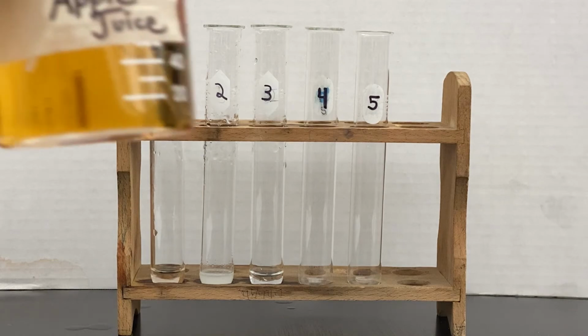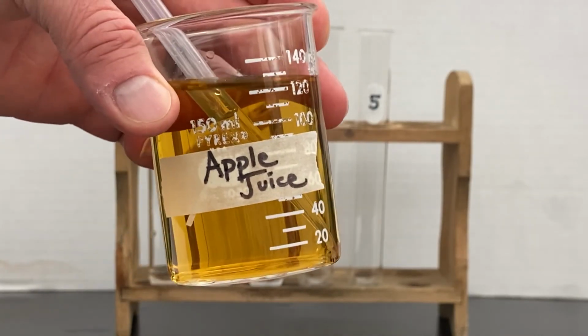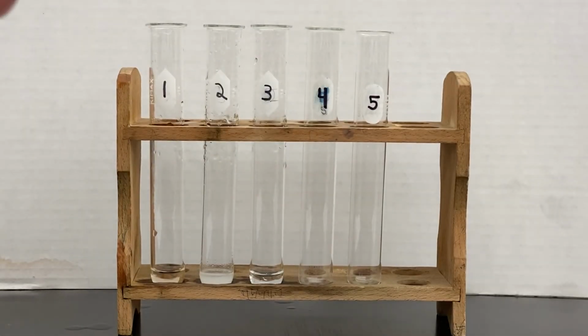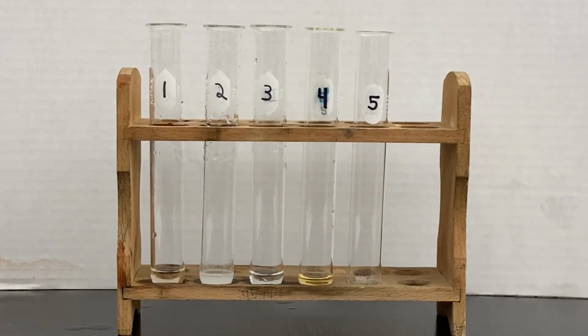And now I'm going to take some apple juice solution made from just plain old apple juice mixed with a little bit of water, and I'm going to put 20 drops of it in test tube number 4. And finally, in test tube number 5, I'm going to take a powdered sugar solution and put 20 drops of it in that 5th test tube.